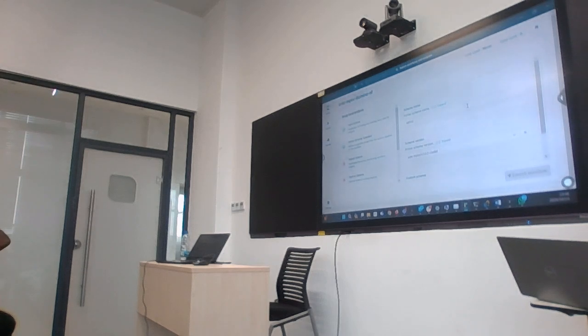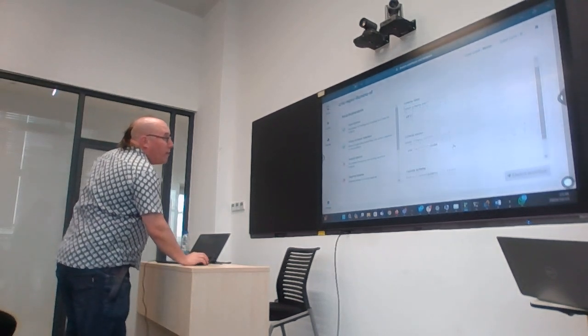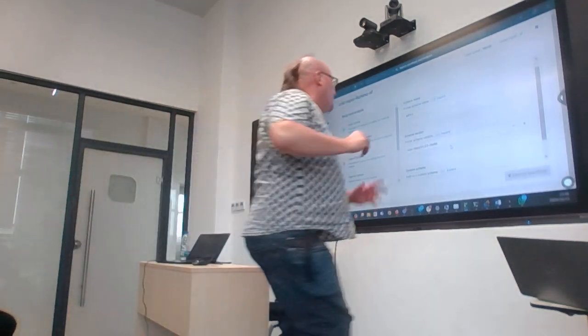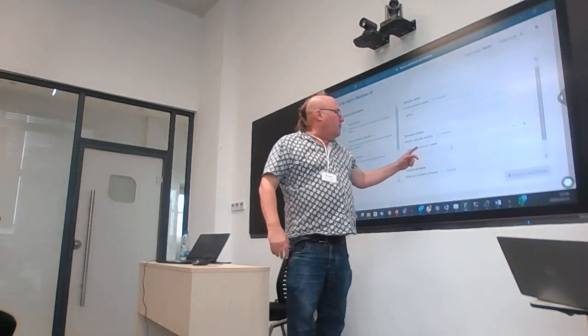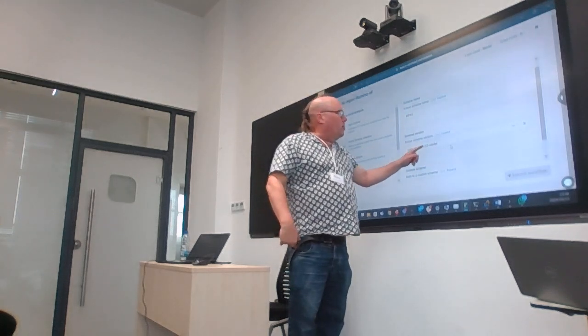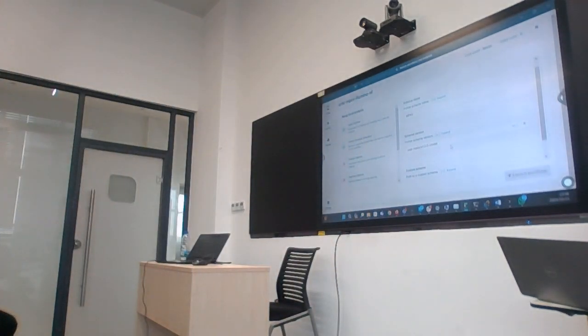Because the actual primers that you put in your plate where you do the PCR, that is MPXV Yale 1.0, okay? But when we're doing the analysis, we can be doing the analysis with regards to one reference or another reference, okay? Clade 1, clade 2, clade 2B, etc., okay?